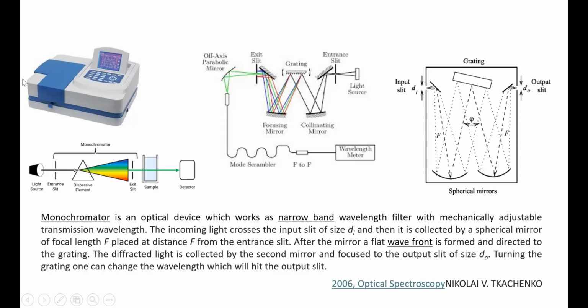If you are working with UV spectrophotometer, you will choose the UV lamp. If you are working in the visible region for analysis, then you are going to choose the visible light source. Now here I want to show you how this monochromator is going to work. A monochromator is an assembly of mirror optical components, which include mirrors, prisms, and diffraction gratings. So what are they? How do they work? That we have to learn in detail.